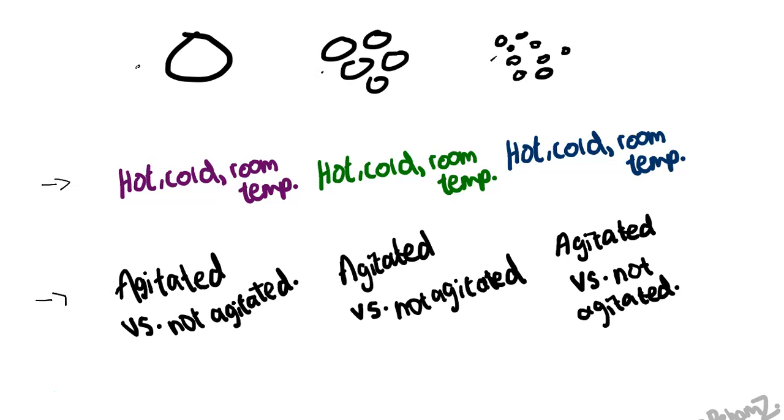So again, go back to your lab report, open it up, go on the first question. It asks you to compare and contrast the rate of solution formation between 3 physical forms of salt that were placed in the vial and not agitated versus the 3 that were agitated. So keep this in mind. This is a great visual representation of what I'm trying to talk about. So keep this in mind. You should be good to go.